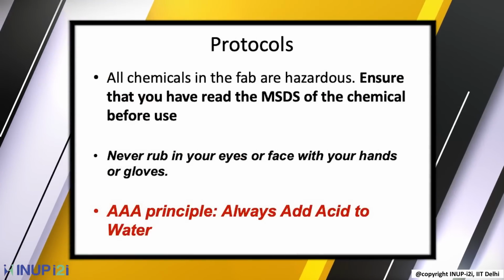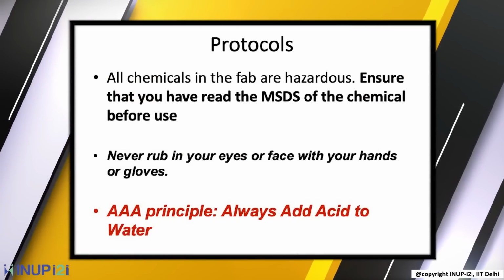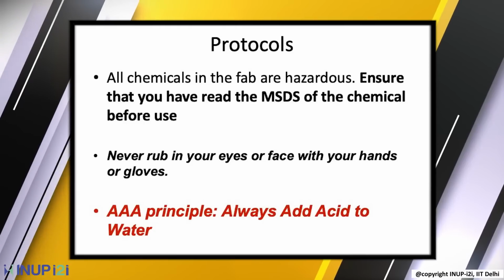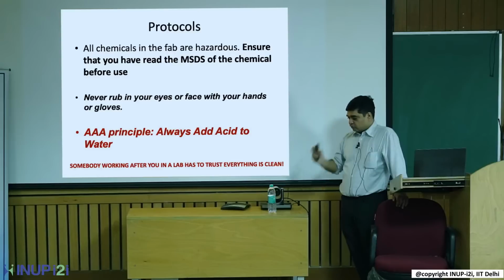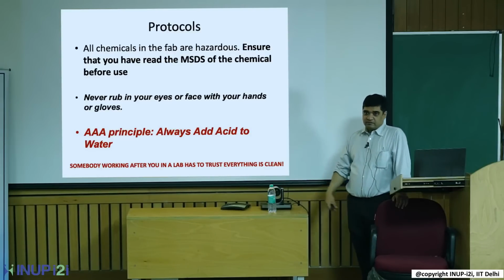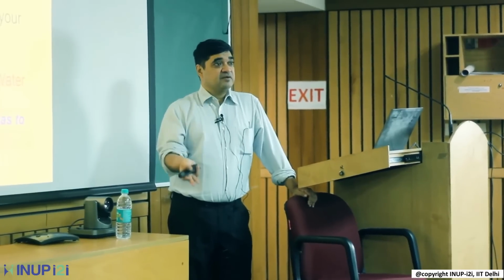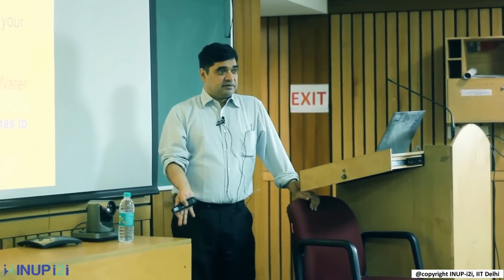Never rub your eyes or face with your hands or gloves. Always add acid to water. We always teach that in high school, but people always forget. Always clean up once you are done. You don't want to keep a beaker full of any colorless or colored liquid, because you may think it's benign, but the person coming after you doesn't know. Similarly, for minor spills, you need to clean up everything before you leave. It may just be DI water, but the person coming after you doesn't know it's DI water, right?